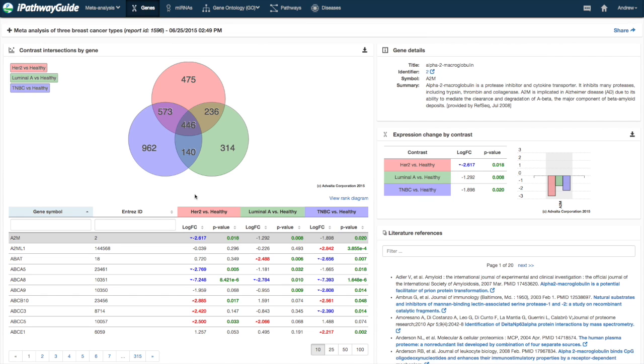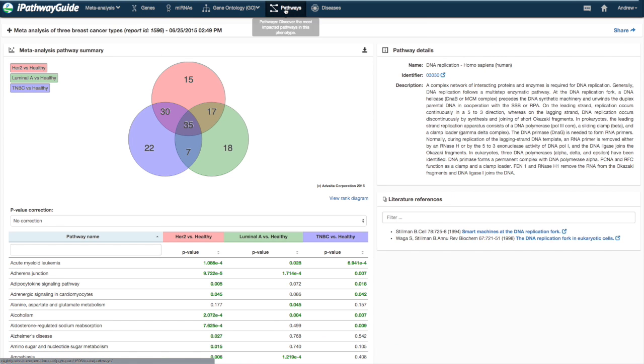The default view is for differentially expressed genes. To see information about other entities, click the corresponding area in the navigation bar.